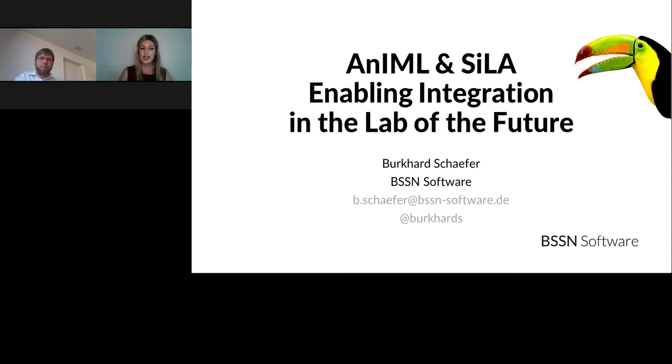So Burkhard, what are the vendors saying about SiLA and AnIML? And are they open or are they afraid?